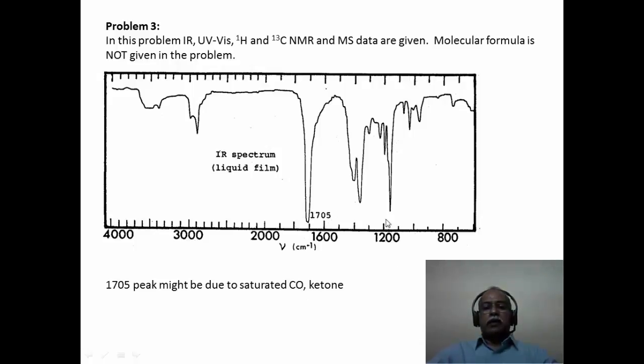So all the other peaks can be tentatively assigned, but one cannot confirm. The only confirmatory information that one can get from the IR spectrum is that it is a carbonyl compound. What you see here is essentially because of adventitious water or something present that gives this broad peak. If it was truly a hydroxy compound, that would be a very intense peak, not a small peak like this. This is most likely due to atmospheric moisture or some such thing in the sample.